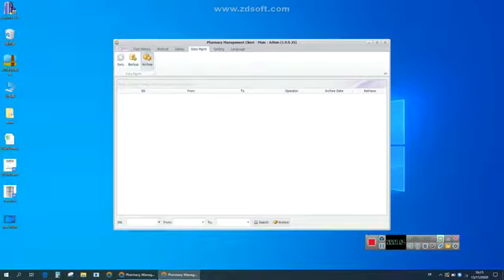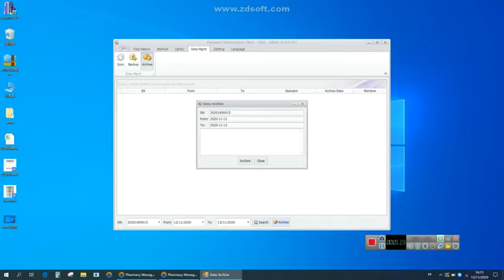And also, after you have archived the database, process complete. So you can see here are the archived records. And also, you have the data management archive.